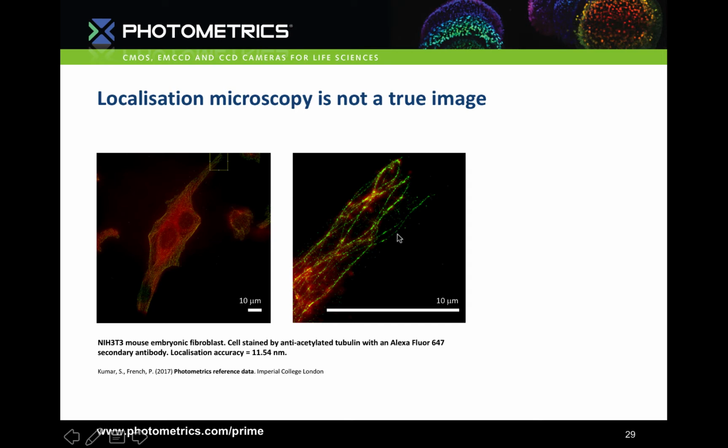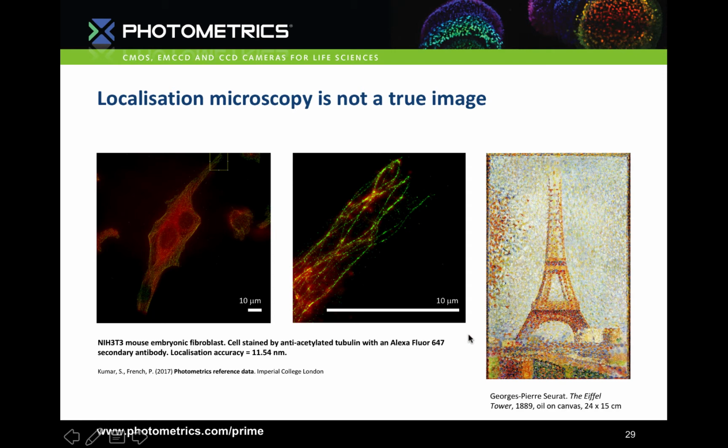It's reminiscent of a Seurat painting, where he hasn't actually painted a real image, but our brain is filling in the gaps for us. This is something that researchers need to think about when deciding if super resolution is necessary for their work.